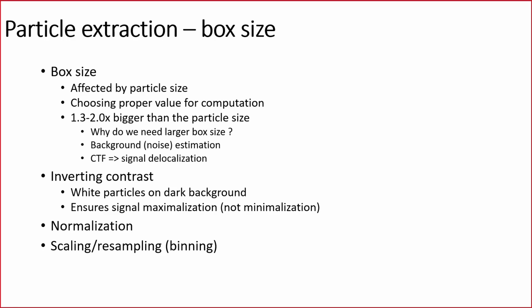Be aware if at some step before this particle extraction you already inverted the contrast of your micrographs, to preserve that you need to have white particles on dark background, because all the refinement and classification software is optimized to maximize the signal, not to minimize it. So it will not work with dark particles.